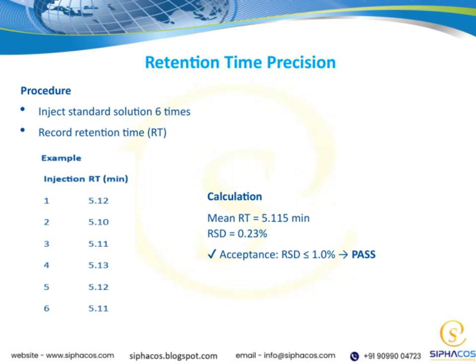Since our RSD is well below that threshold, we can confidently say that our retention time precision is acceptable, so we pass this test. Let's also review the procedure we followed to ensure this consistency.